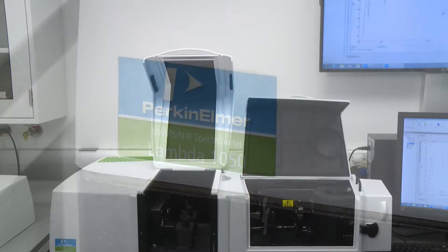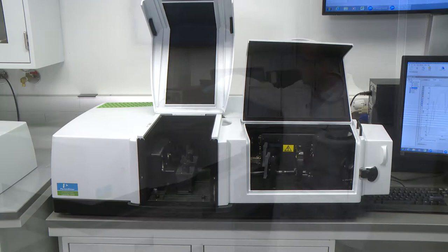Today we're going to be talking about our Lambda 1050 UV-VIS-NIR instrument. These are scanning photometers that are capable of scanning between 175 and 3300 nanometers.